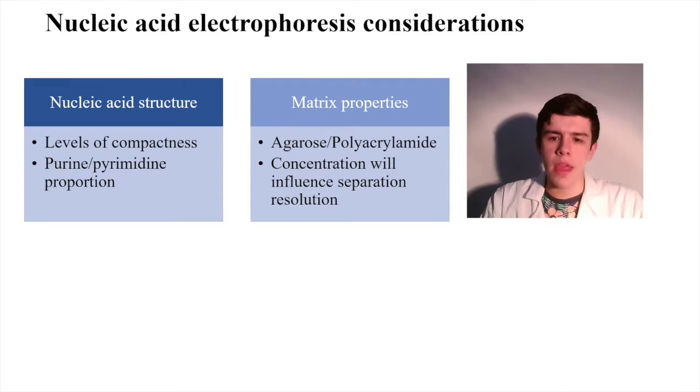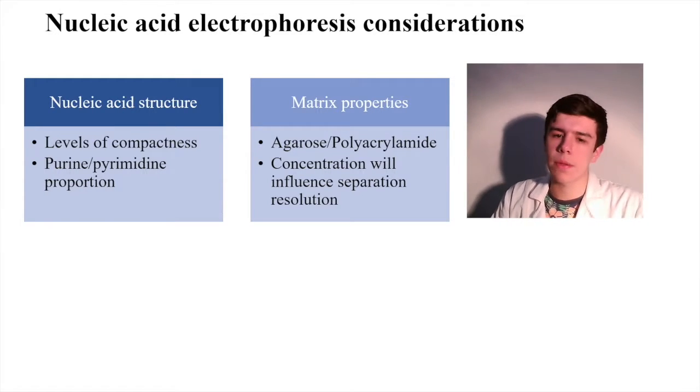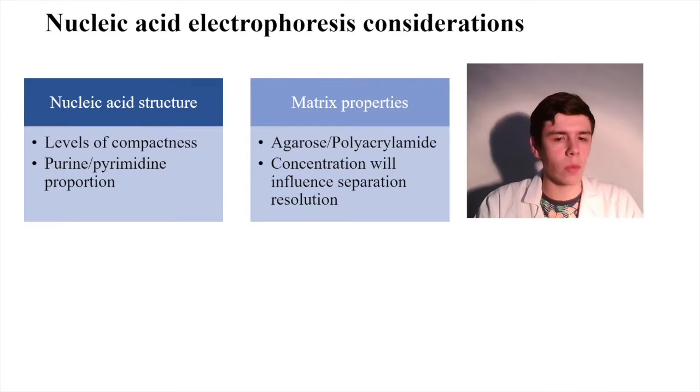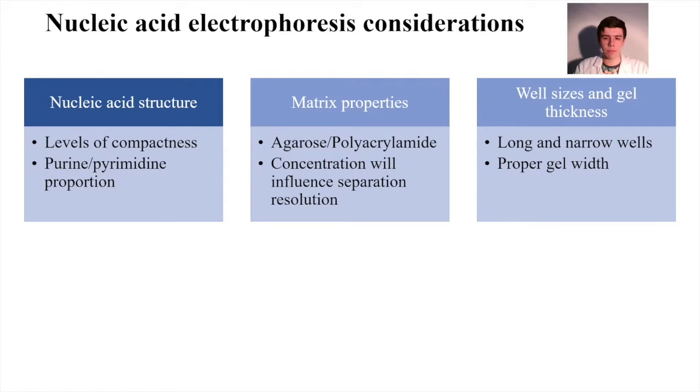Matrix properties. The material in which the analysis will be run has an important effect over the results. The most common options are agarose and polyacrylamide, depending on molecular weight. Remember, concentration will influence separation resolution.